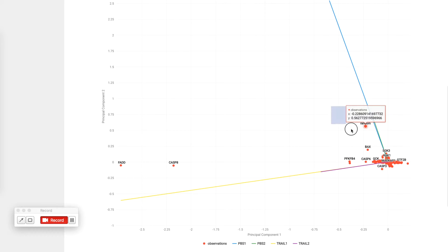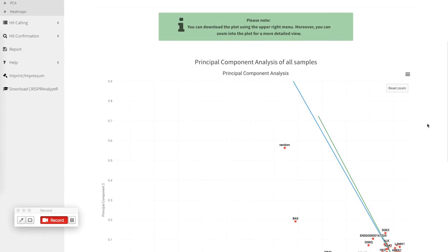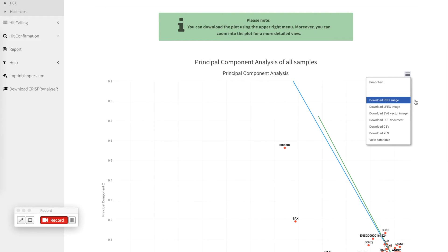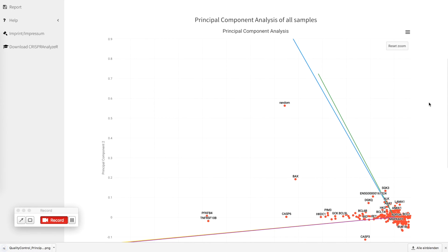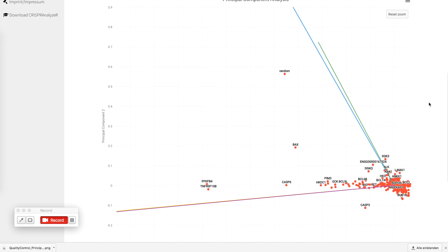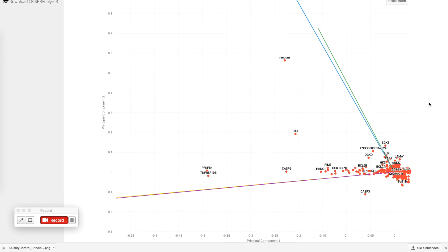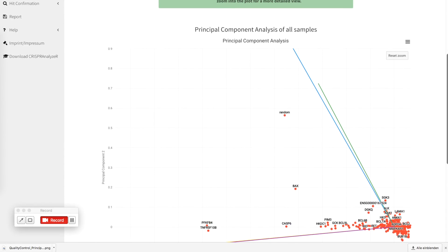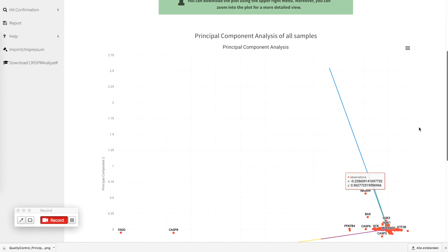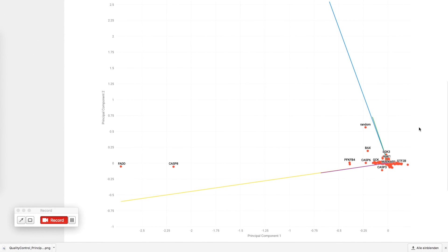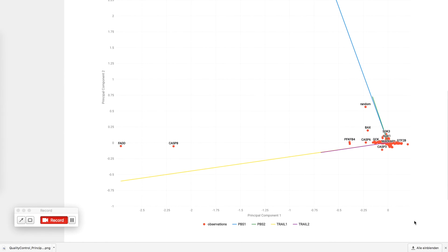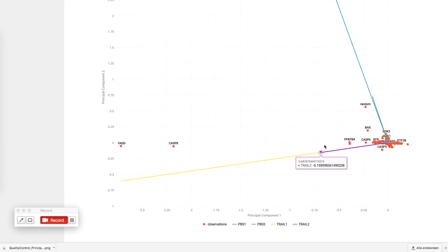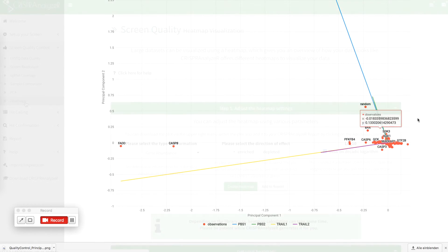You can zoom in for more detail and you can also download this visualization as it is to your computer. The PCA is automatically added to your report and is still interactive later on. So have a closer look at your data and in case your replicates show exactly the same effect, it will be easier that both of the treatment replicates show a trajectory going into the exactly same direction for the treated and for the untreated.